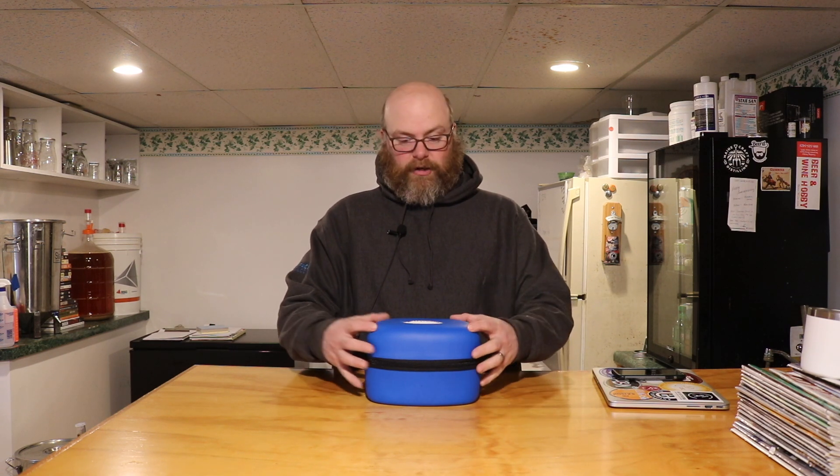Hey, it's Mike from BrewtoActuallyUse.com. This week we're going to be going over the LaMotte BrewLab Plus kit. In this little blue package are all the reagents, little tubes, and testing devices you need to determine how much calcium, magnesium, sodium, chloride, and sulfate — all the good stuff you need to know for your brewing water. I'm going to walk through all the pieces, show you the tests, and then compare the results to a Ward Labs test I had done last year to see how much confidence we can have in this kit for testing water at home, which will hopefully help us brew better beer.